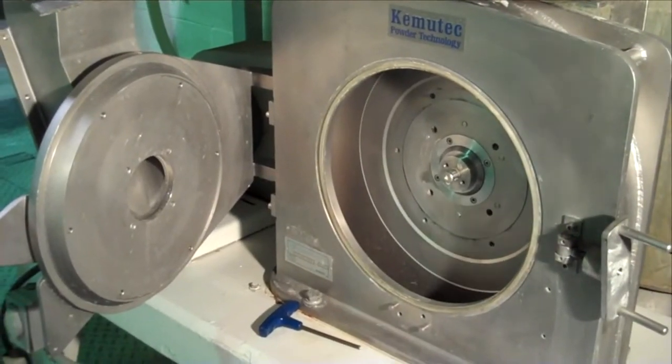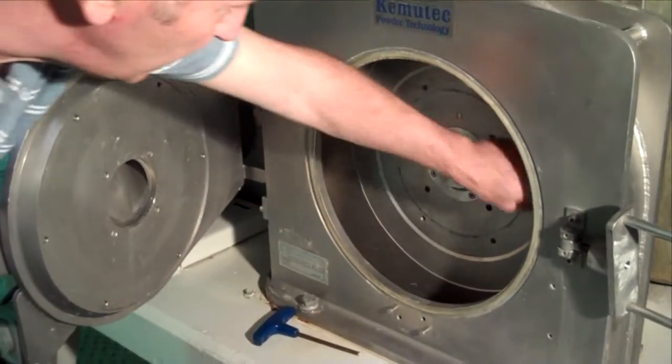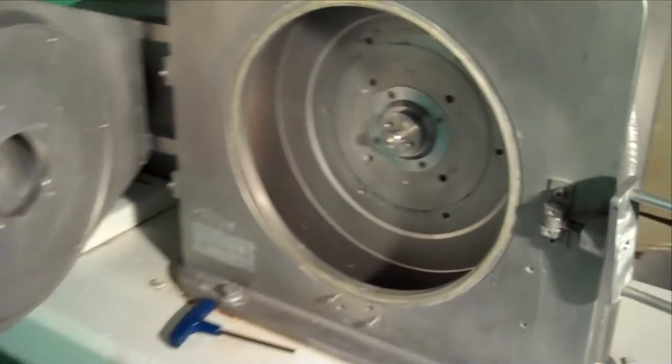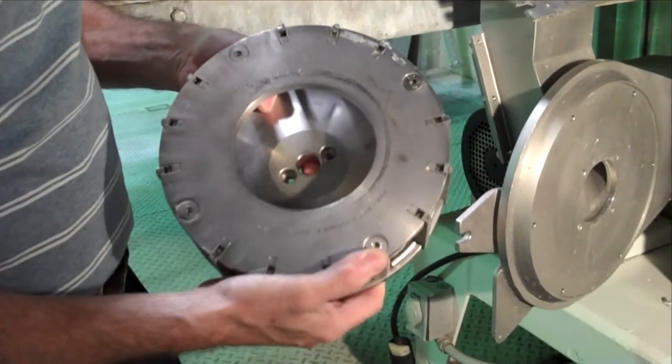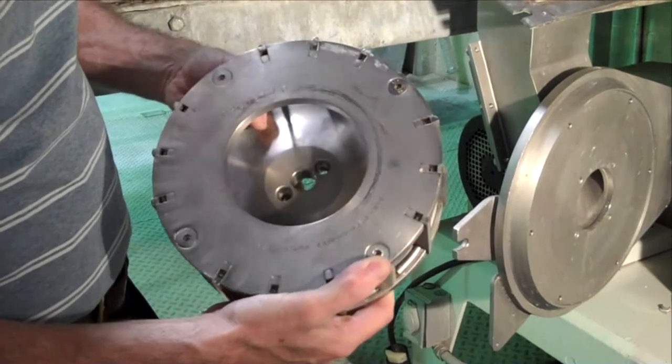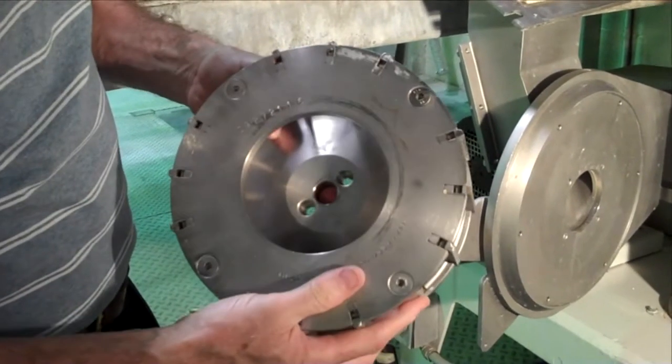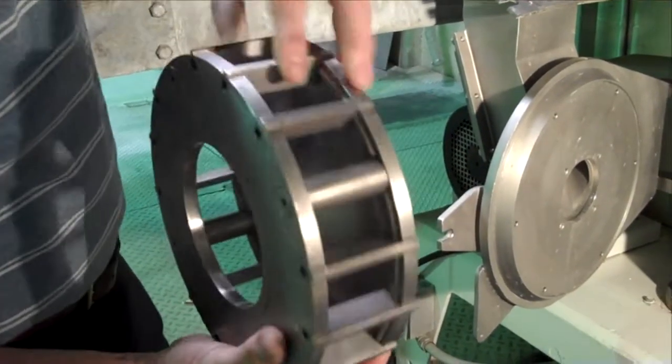With the grinding media removed, the mill is left with nice clean easy access, hygienic and ideal for maintenance and regular cleaning operations. The alternative grinding media is the turbine and screen arrangement. In this setup, the high-speed rotor is mounted onto the main drive shaft. Turbine blades here perform the impact grinding.